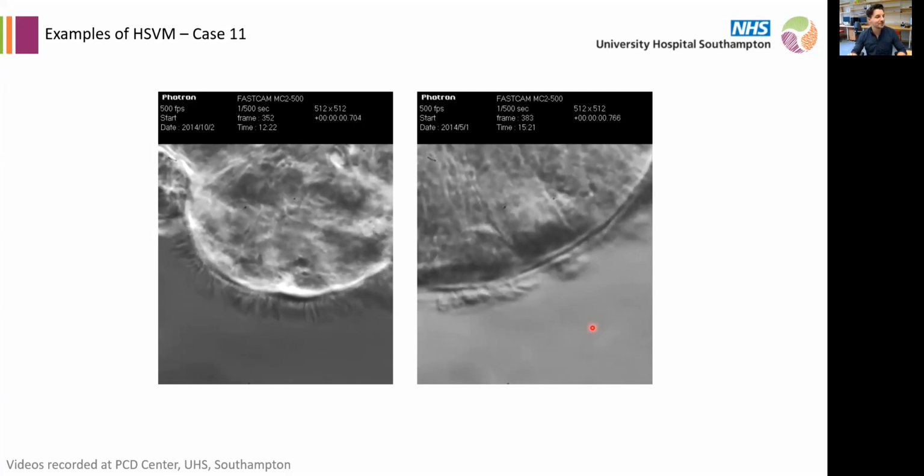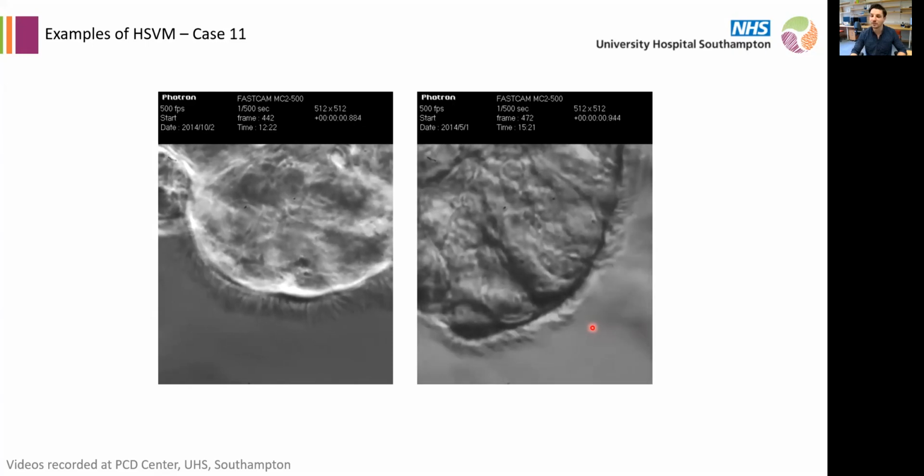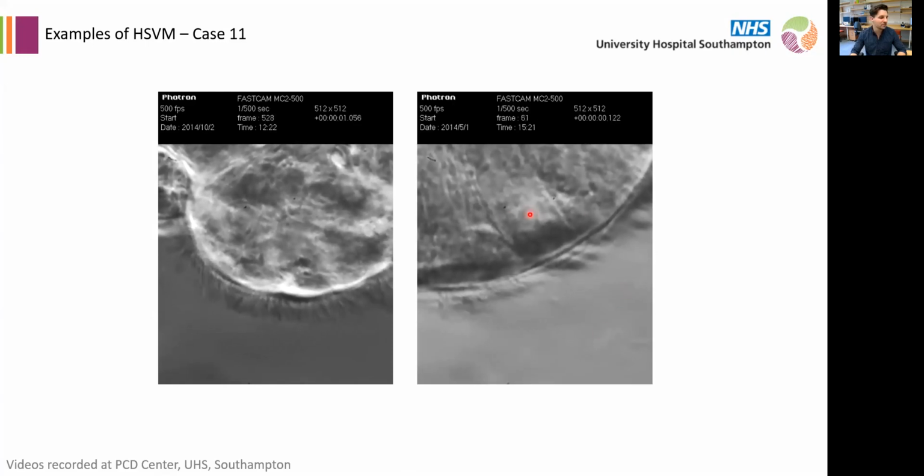So it's actually a little tricky one, because this is once again a DRC patient, and so the beating pattern looks somewhat normal, but we can see some pause and staggered movement. And if you look here, it seems that every other beat is smaller than the other one. You see, it's like you do a normal beat, then you barely come back, and then you do a normal beat. And so Claire Jackson told me that it was actually seen by 3 different people in Southampton. And when they did culture, most cilia actually just stopped beating. So once again, DRC1, dynein regulatory complex 1.